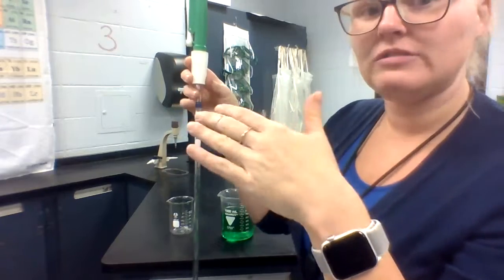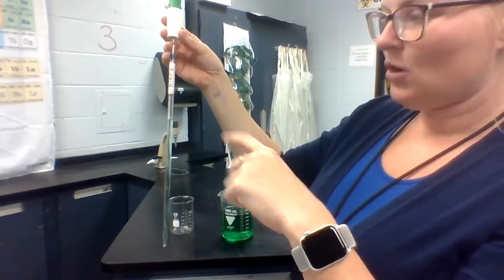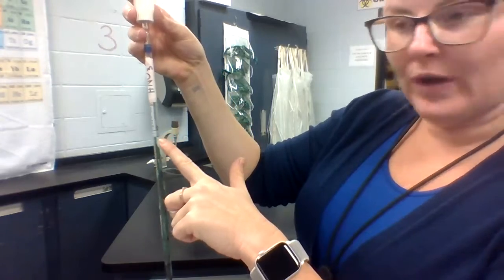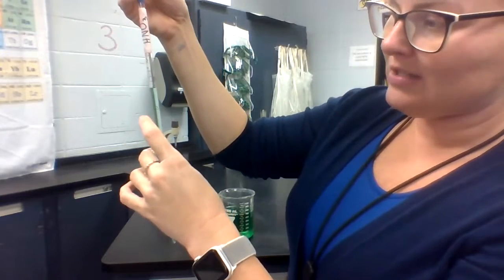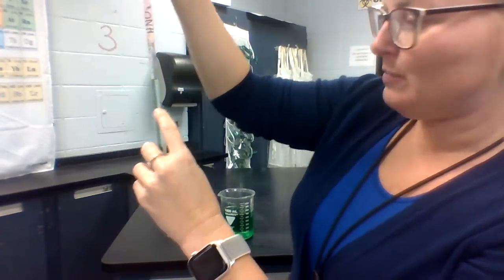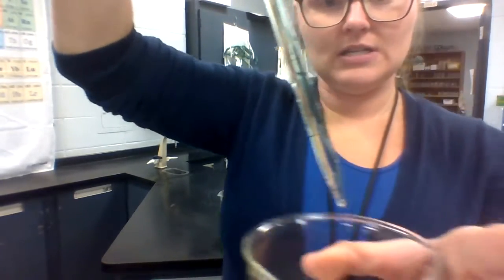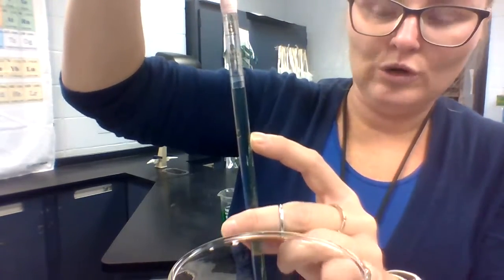Now, the lab is going to tell you how much you need to dispense. So let's assume that I need to dispense one milliliter. I need to add the original volume — which is 0.23 — plus one, and that's where I want to dispense to. So I want to dispense down to 1.23. I'm going to dispense into the beaker — hopefully you can see that — down to 1.23.